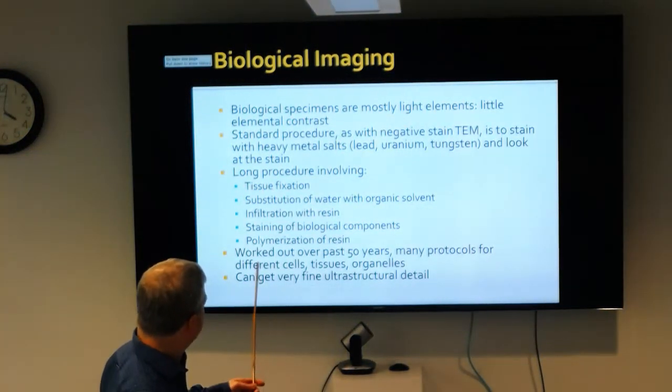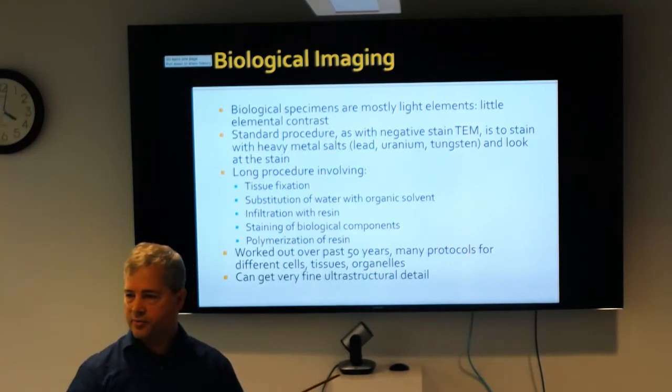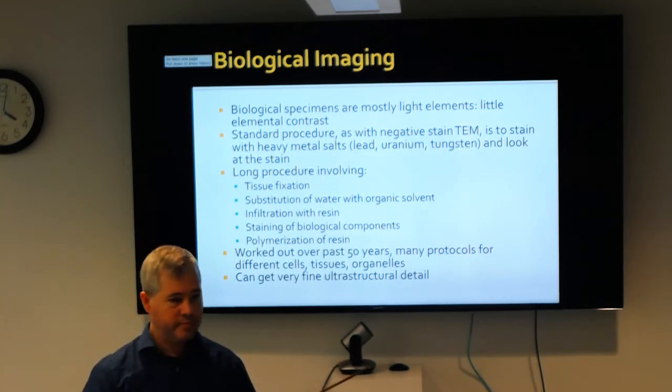So from the SEM part, I'll jump into the focused ion beam, unless there are questions right now about SEM before I go into it.